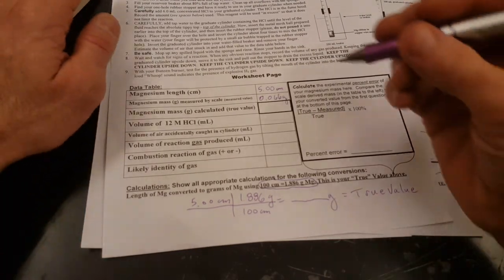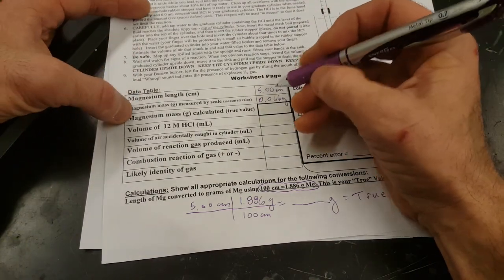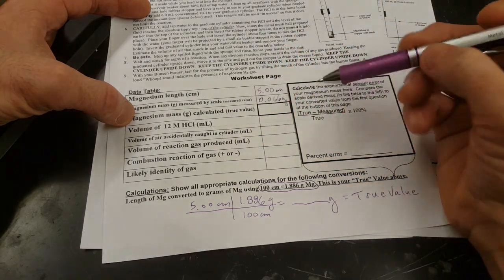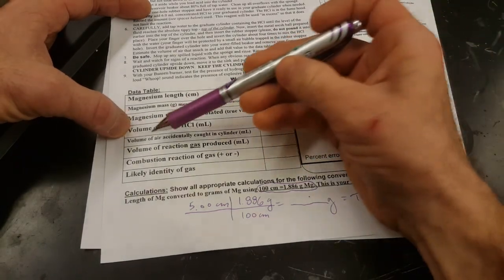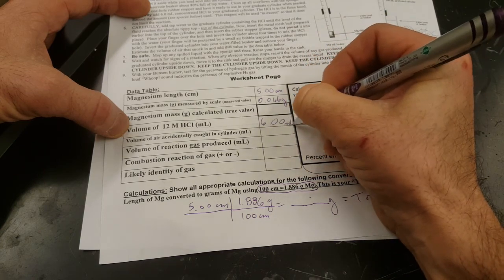So we've got some more information. Again, this is my data. Don't write this on your lab. You'll have your own data. But the magnesium mass, the calculated true value, is right here. The volume of the 12 molar, I put in 6.00 milliliters.